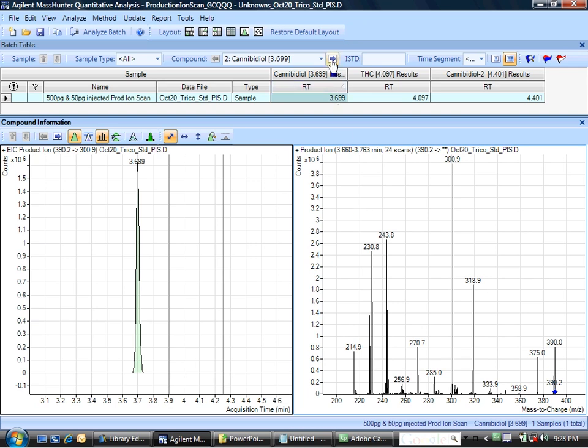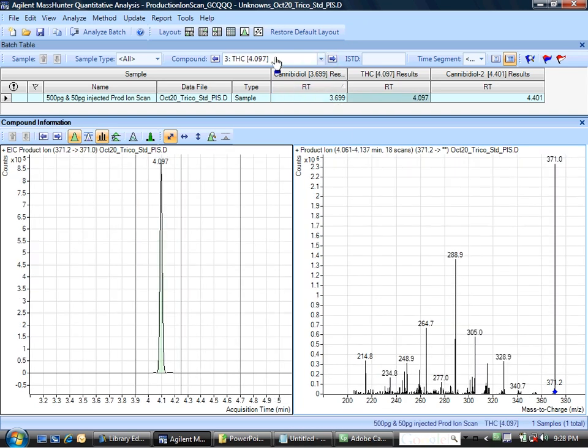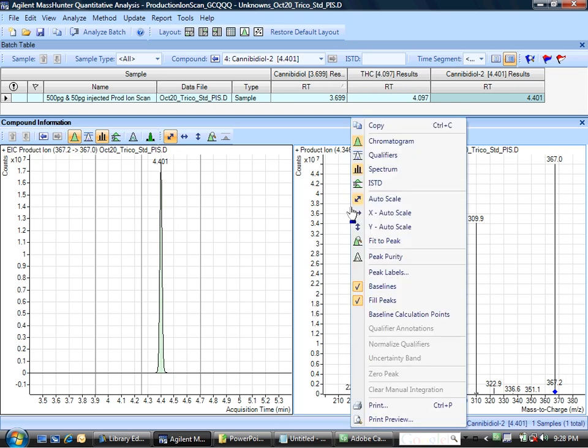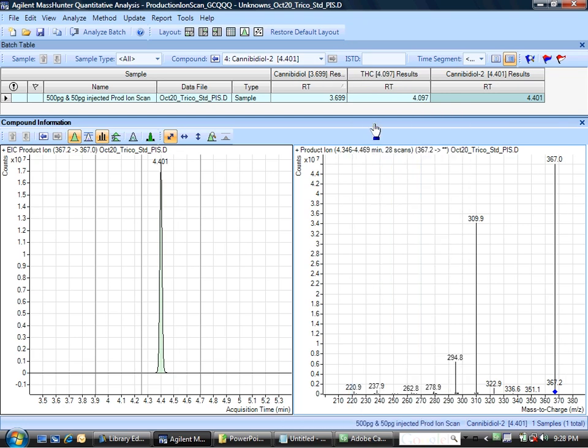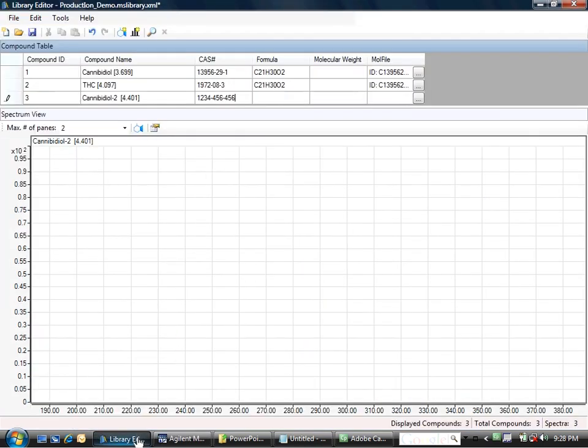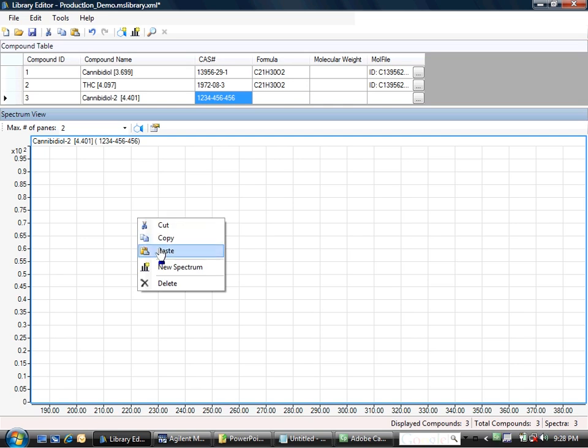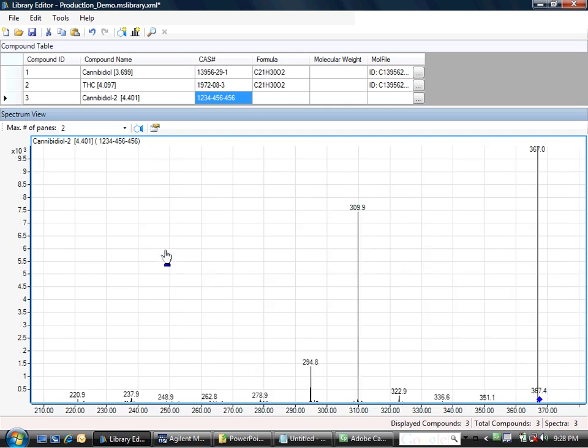Cannabidiol, there's the spectrum. THC, there's the spectrum. And now I have Cannabidiol-2, which elutes later. And I'm going to, in the spectrum window, copy that spectrum, which puts it in the clipboard. And now I will go back to the library editor and I will paste that spectrum in here.